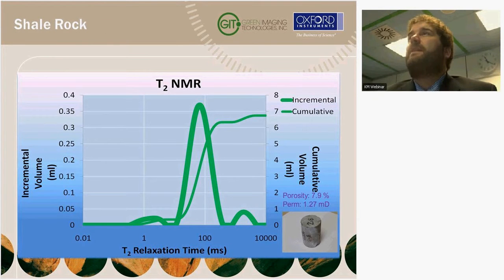We do different types of rocks. The NMR measurement works in almost all types of rocks. We've done, and not just us, regular sandstones and carbonates, of course, but our work is more recent. Oil sands, particularly with new equipment, are showing some promise because we're able to see some of that heavier oil that we couldn't in previous generations of equipment.